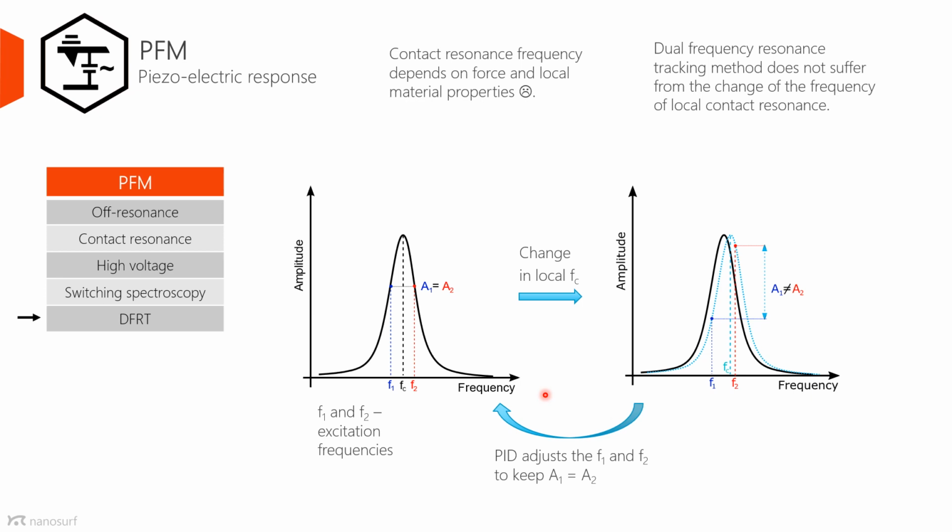making this very inconvenient for this amplification to be used. To make it convenient, we need a method to track this resonance. The DFRT is exactly such a method.